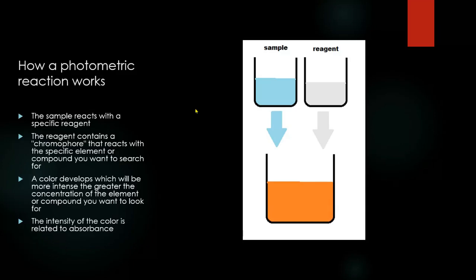The intensity of the color is related to absorbance. You can imagine that a liquid with a more intense color can absorb more light than a pale or transparent liquid. Okay. Is everything okay until now? Yes, yes. Okay.